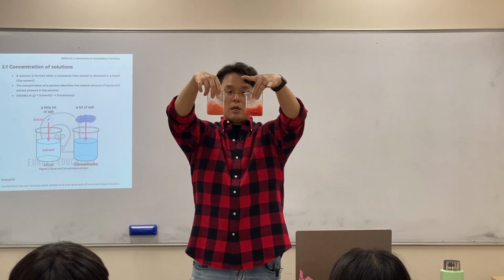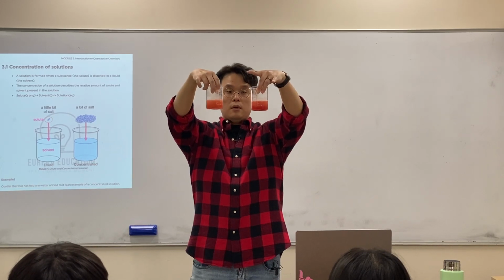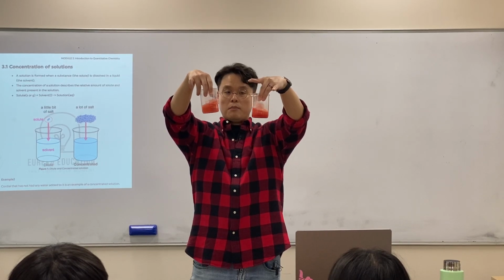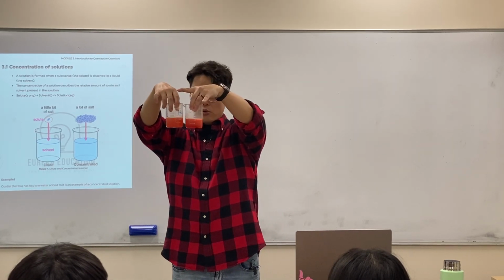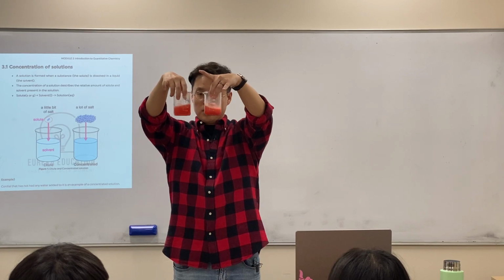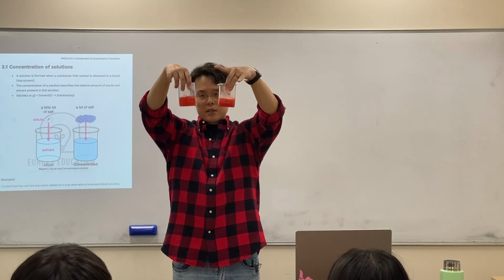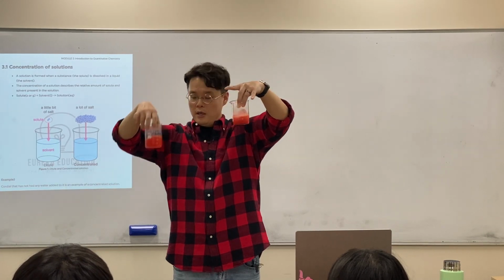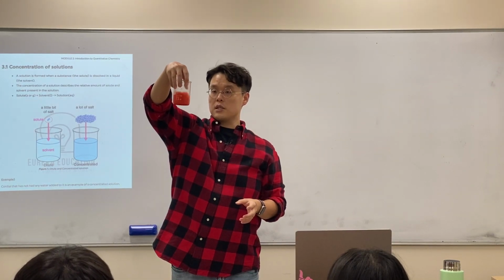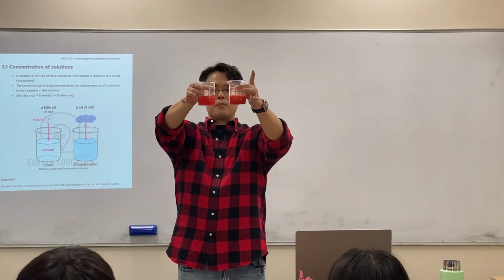You can expect that it's dissolving everything in there, and the fizzy sounds come out. Right, just waiting for it all to get melted. Now, looking at these two solutions, one with one tablet and one with two tablets, what can you tell me about the difference between these two? This is a little bit darker. It's not that clear, but it's actually showing more fizziness, and as we dissolve it more, it's going on to a darker red, unlike the pale, pretty pink there.